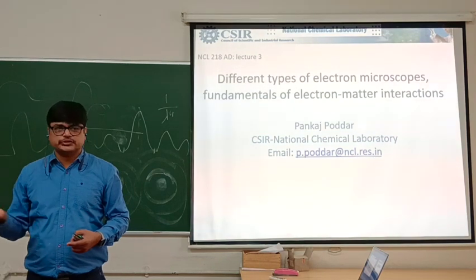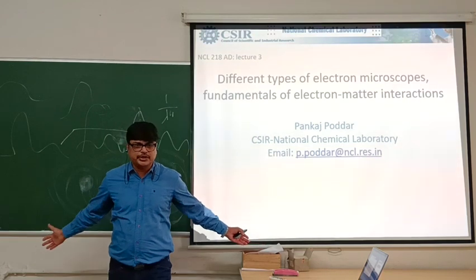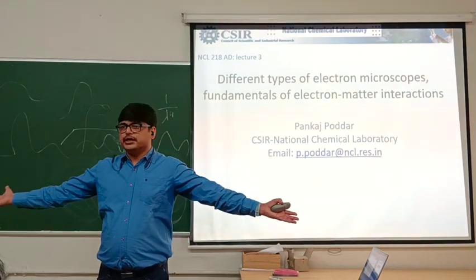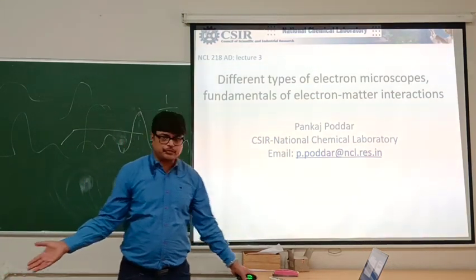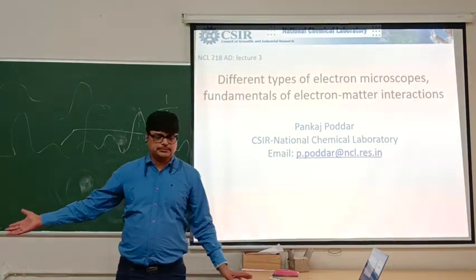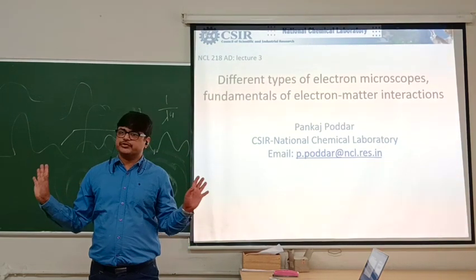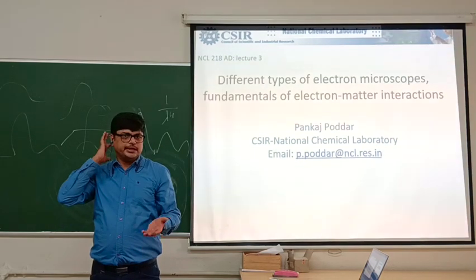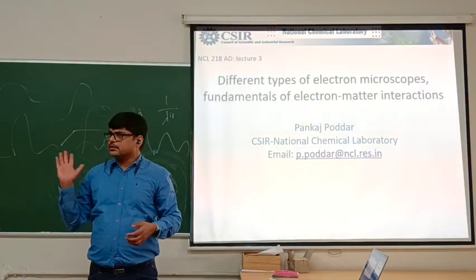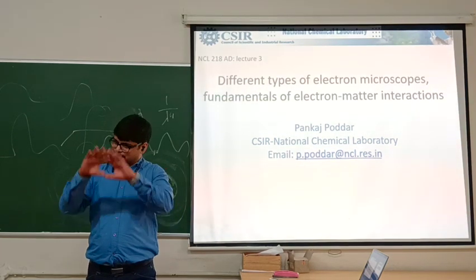I want to know the spatial distribution of these atoms. And if I just illuminate the entire area, I don't plot anything. It will give me an average round number. Right? It's a problem with inductively coupled plasma (ICP) also. ICP will give you just an average round number, right? You just dissolve the sample in acid, run ICP. It will give you the atomic percentage in the entire sample, right?